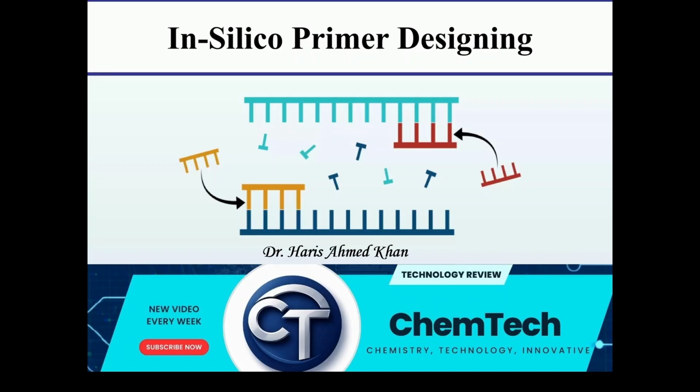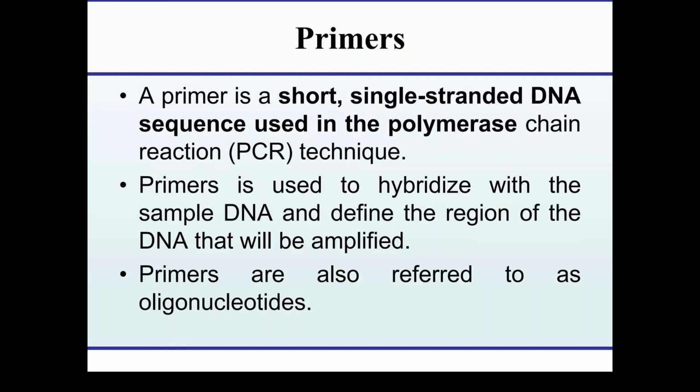In silico primer designing is a fundamental concept in molecular biology, bioinformatics and modern genetic research. In this lecture, we will not only understand how primers are designed computationally, but also explore the scientific principles behind their efficiency and specificity. Let me begin with the basic concept.